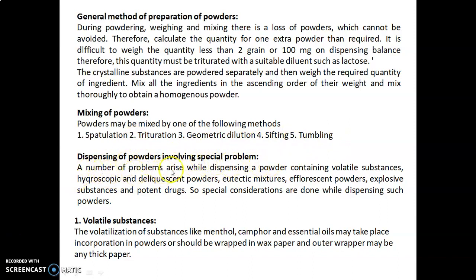Dispensing of powders involving special problems. A number of problems arise while dispensing a powder containing volatile substances, hygroscopic and deliquescent powder, eutectic mixture, efflorescent powders, explosive substances and potent drugs. So special considerations are done while dispensing such powders.